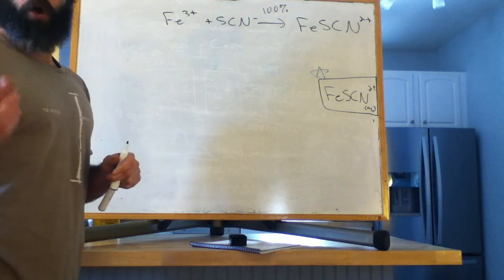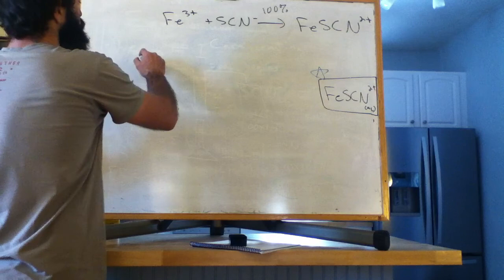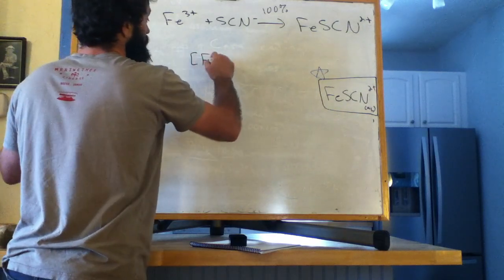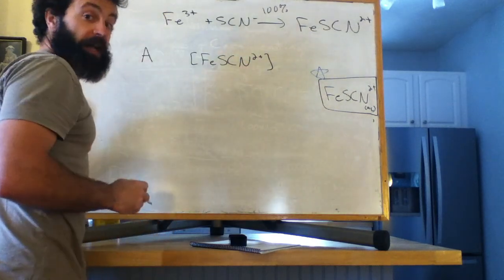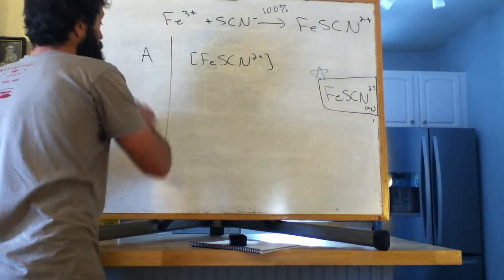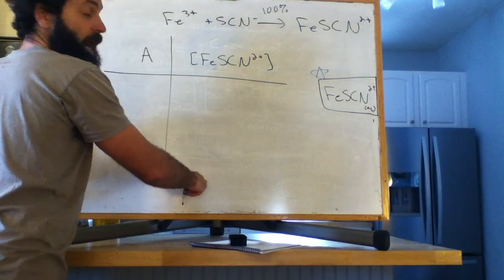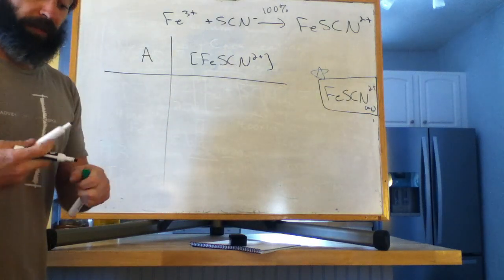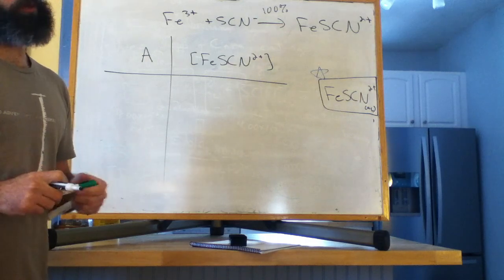So from the video that Scott recorded that I posted for you, you should be measuring absorbance values for all of our different standards that we know the concentration of. So you should compile data where we know the concentrations of this complex, we measure absorbance values. Now we can figure out the relationship between absorbance and concentration. Okay, so how do we do that?